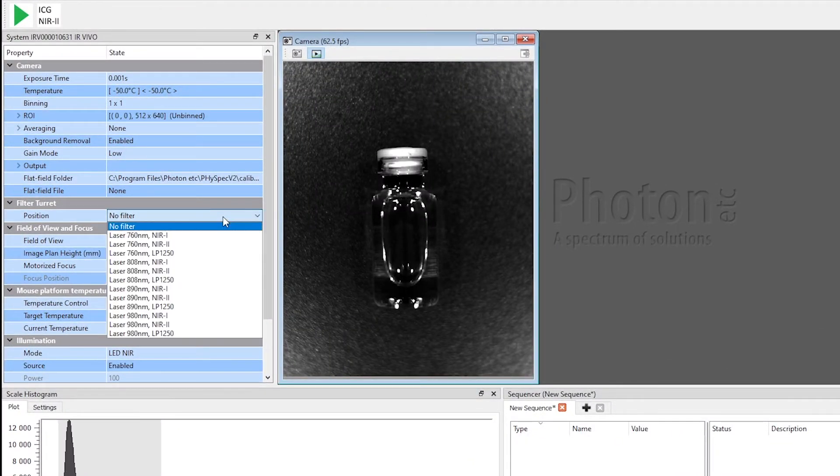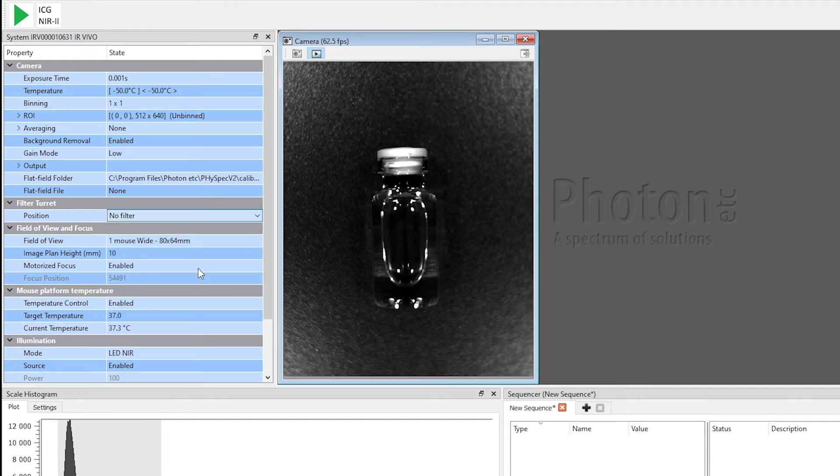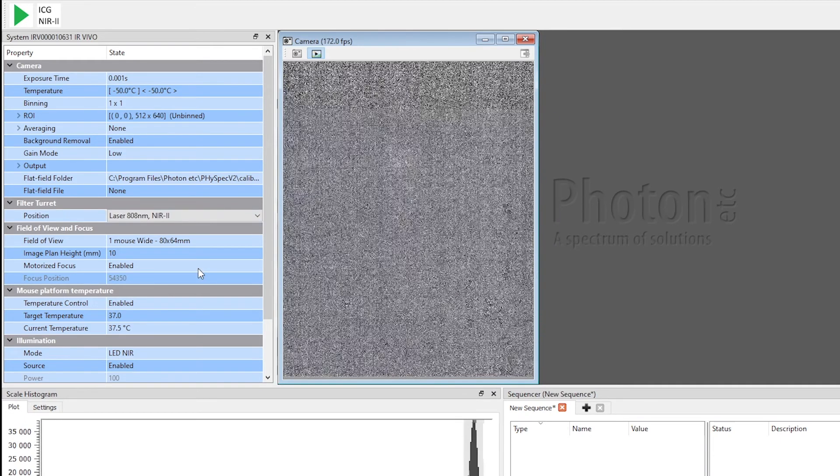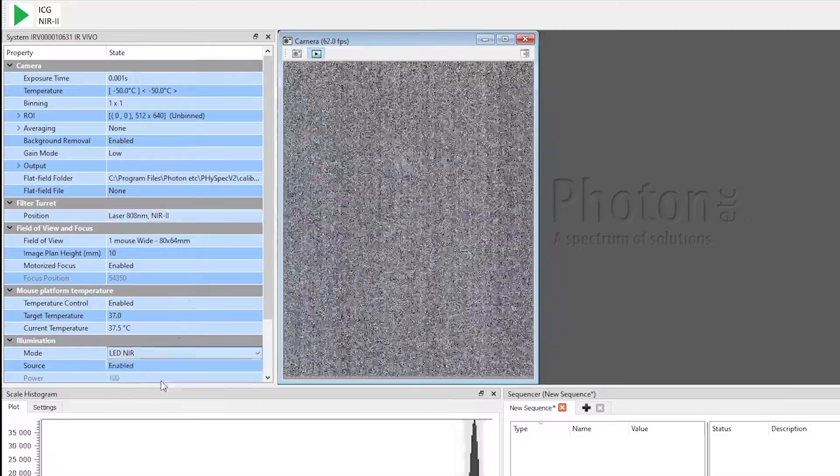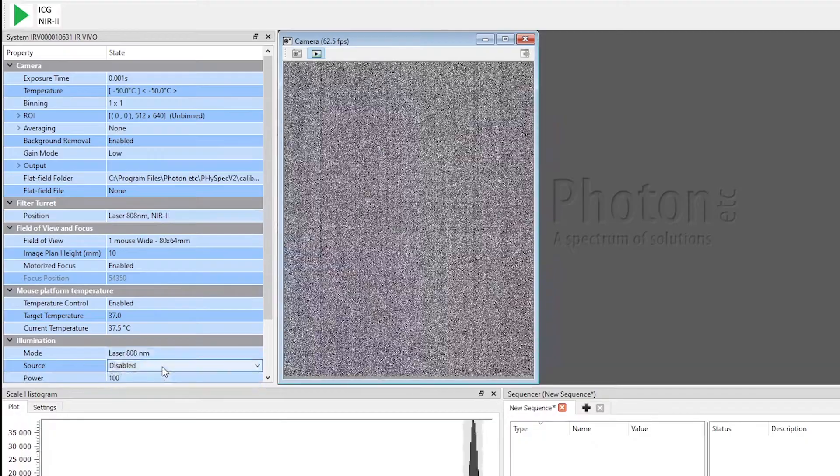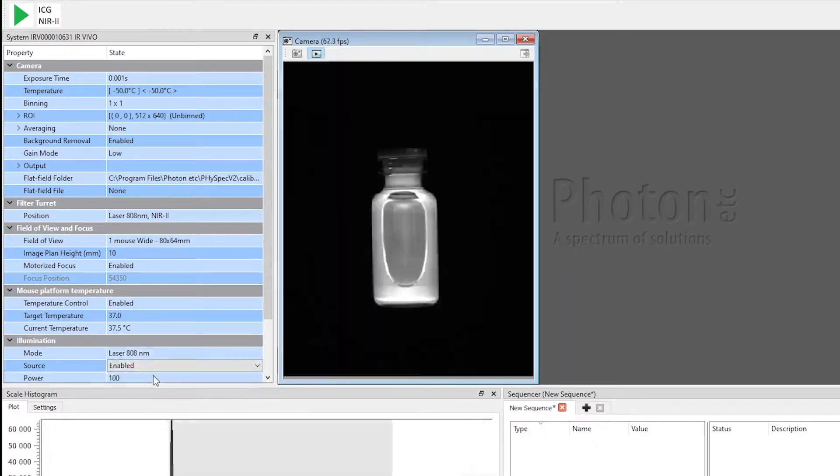Then, to capture the fluorescence, we need to set a filter matching the laser. In this case, ICG works best with an 808 laser, so I chose the filter accordingly. Then, I'm selecting the 808 laser. And as soon as I enable it, I get to see the fluorescence very clearly in real time.